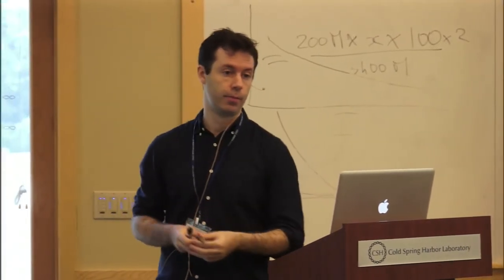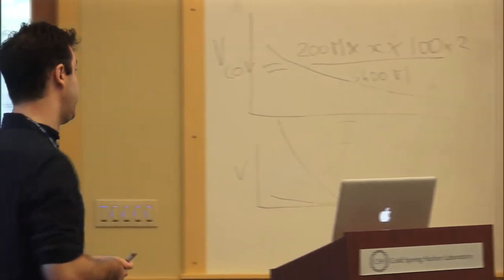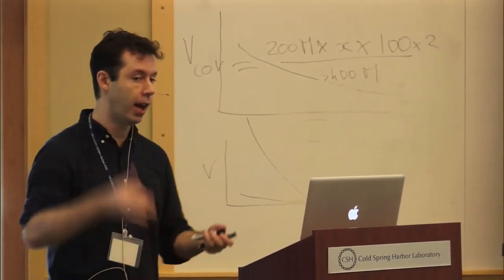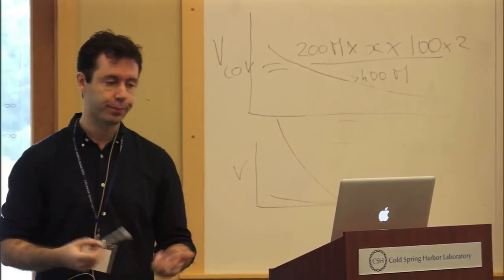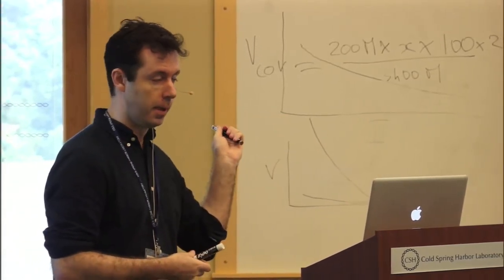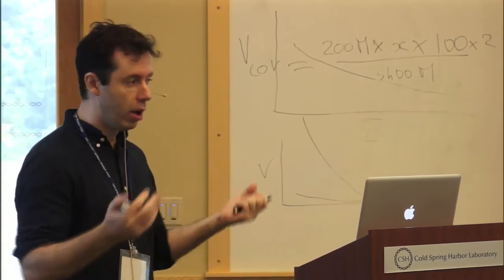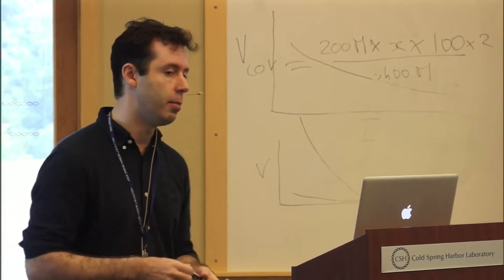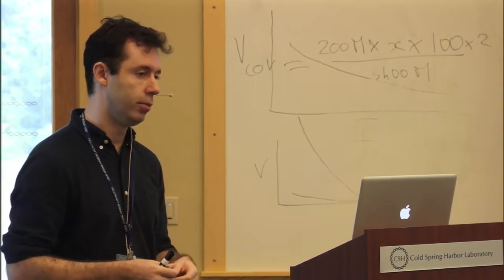How would that translate for RNA-seq? For RNA-seq, the concept of coverage is a little bit different, because you have genes that are highly expressed and genes that are not very expressed. So what that gives you is an average coverage, basically, meaning average across multiple genes. Whether this is a highly informative measure or not depends on your way of thinking.